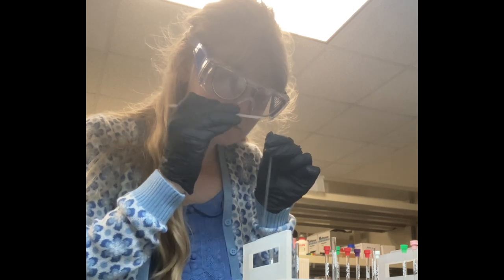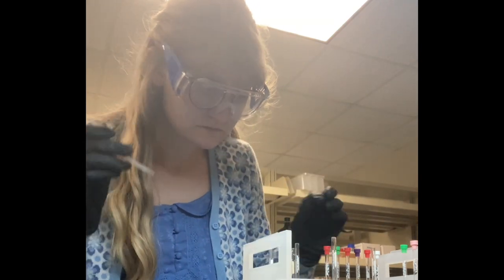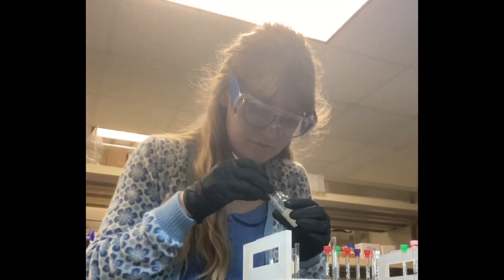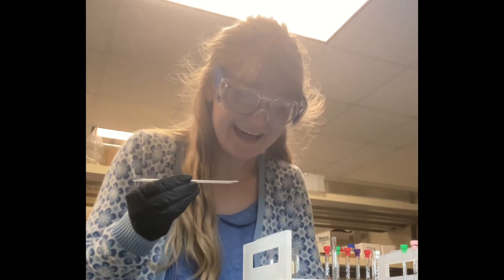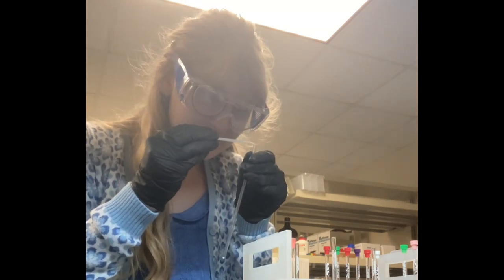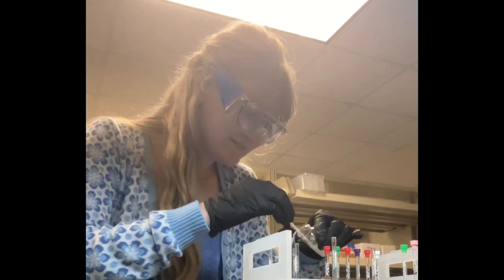Here I am basically putting a texture that's very similar to earwax into a teeny tiny glass tube. Then I will be adding a deuterated chloroform solvent to dissolve my compound so it can be interpreted correctly by the NMR. We use deuterated solvents because if we use regular ones with protons, it would confuse which peaks would actually be our compound versus any solvent in the NMR sample.